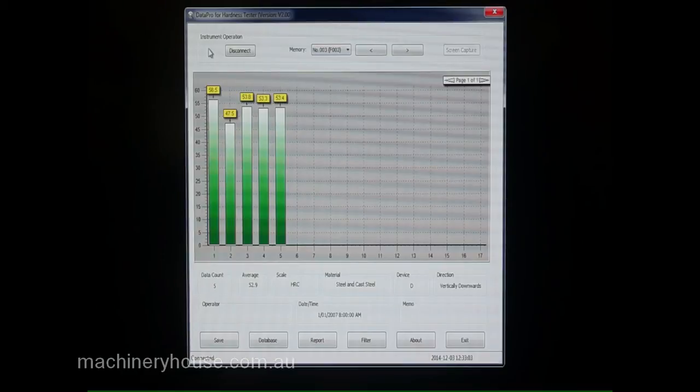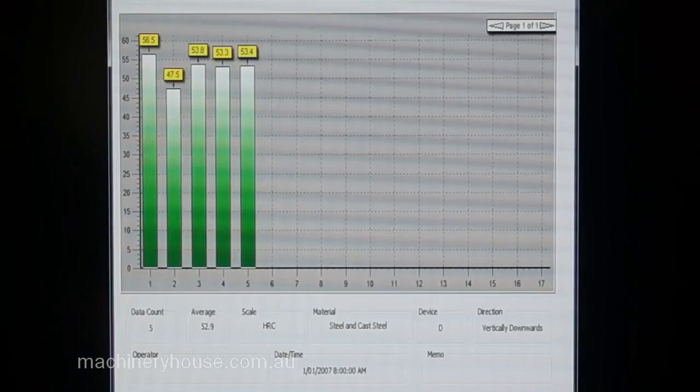Installing the data software allows you to move data over to your PC, retrieve, set limits, save, print reports, and even transfer collected data to Excel.